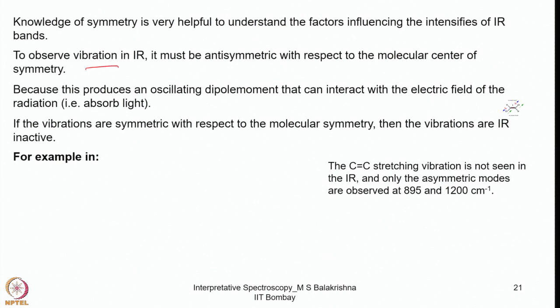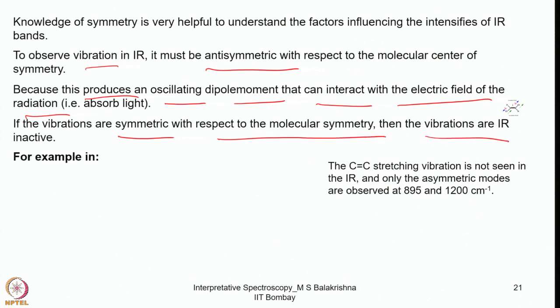To observe vibrations in IR, the vibration must be antisymmetric with respect to the molecular center of symmetry. That's important. This is because it produces an oscillating dipole moment that can interact with the electric field of the radiation, so it absorbs light. If the vibrations are symmetric with respect to the molecular symmetry, then the vibrations are IR inactive, and you don't see any bands corresponding to that.